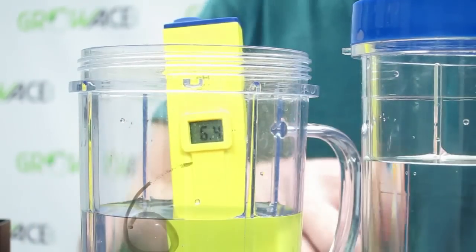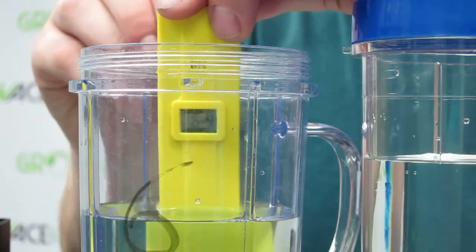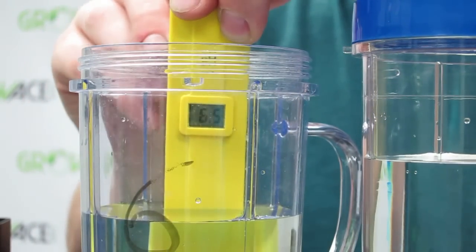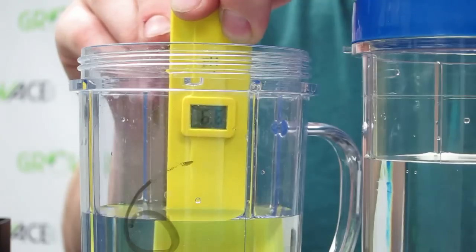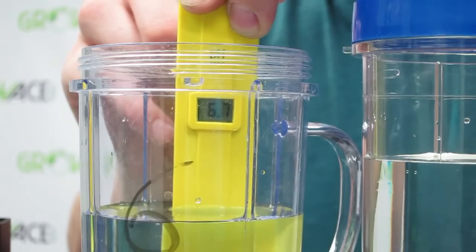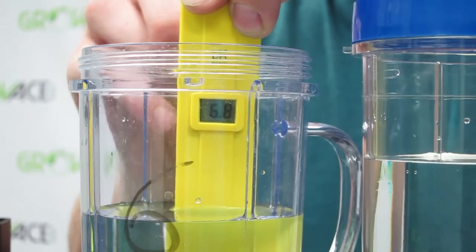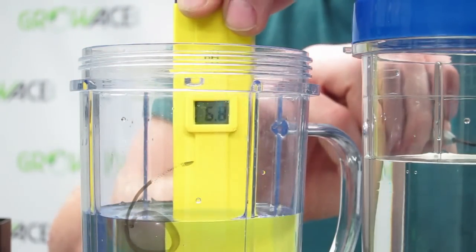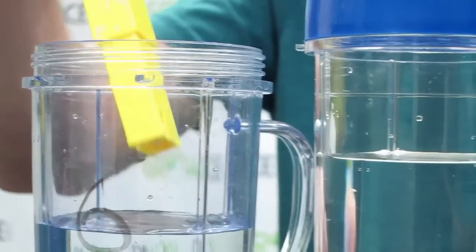If the meter doesn't read 6.8, take the screwdriver and set to 6.8. Turning the adjustment screw to the left raises the reading and turning it to the right will lower the reading. Then rinse it off with some distilled water.